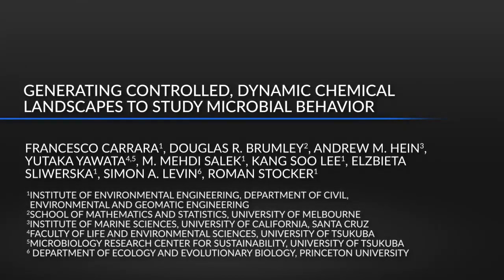This method allows to elucidate the microscale ecology and behavior of microorganisms navigating dynamic chemical gradients, and to uncover their hidden trade-offs, nutrient kinetics, and population dynamics in ecologically relevant microenvironments. By combining microfluidic technology with photolysis, we generate controlled chemical pulses where localized chemoattractant becomes suddenly available at the microscale to measure the chemotactic response of microbial populations first exposed to unsteady chemical gradients.